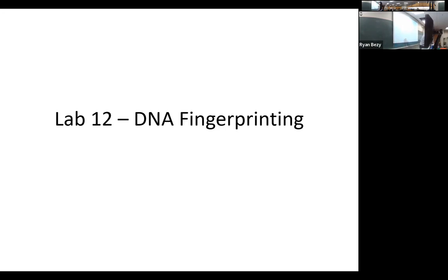There'll be another incubation period. I might lecture a little bit more or just talk about the next part real briefly. But also there'll be some downtime set aside for you guys to do your colony counts for your plates, your group projects that you did last week.